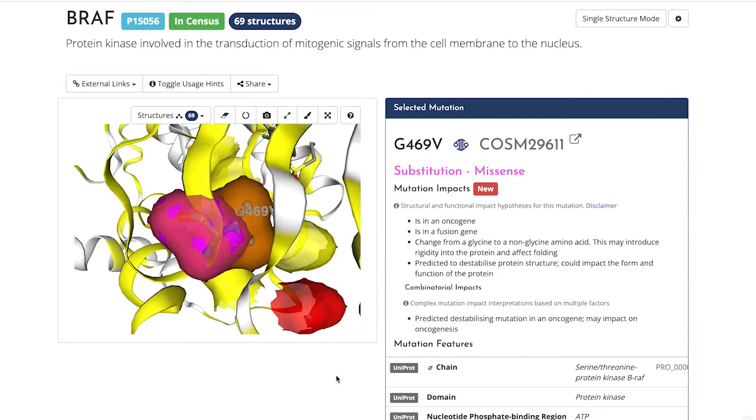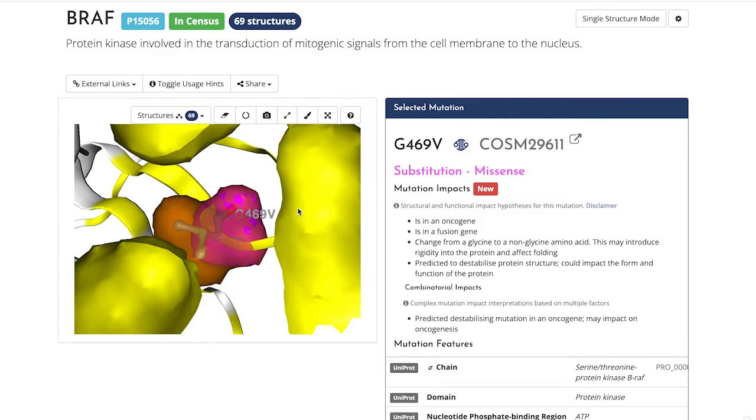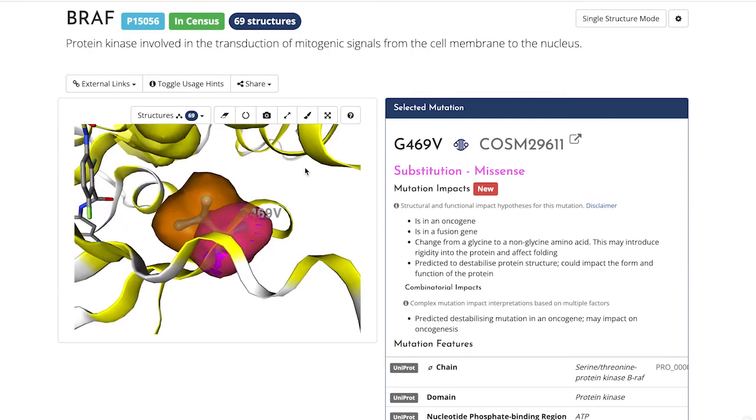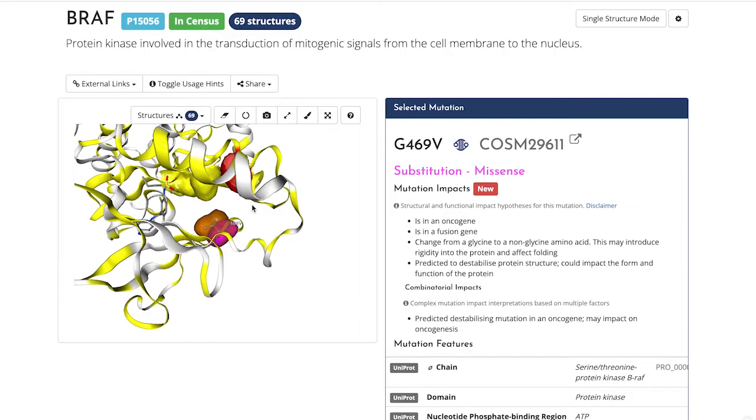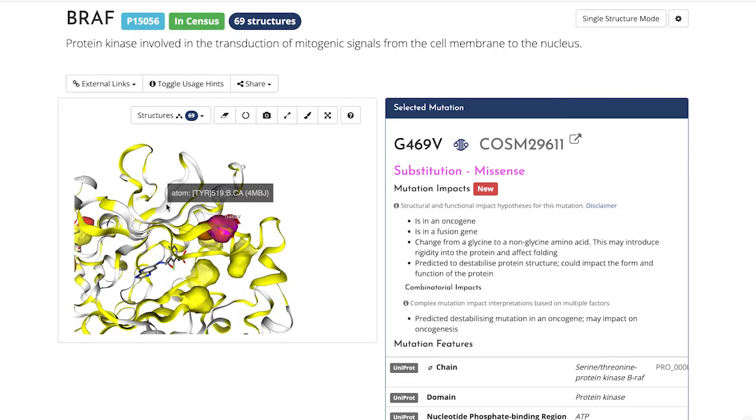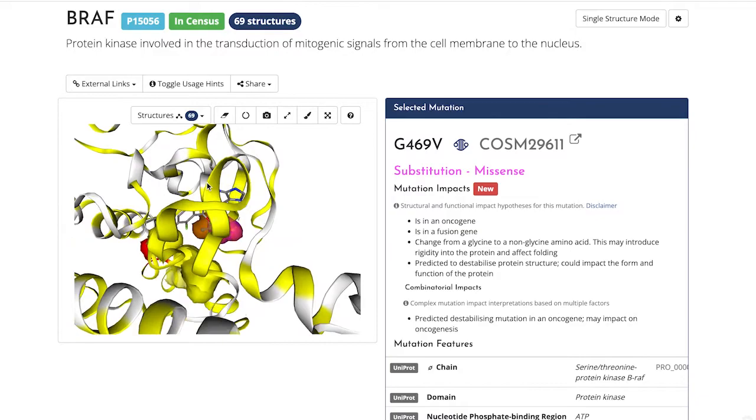And on to the exciting bit. You can actually see the predicted side chain of the new amino acid and the space it might occupy. Cosmic 3D substitutes the old amino acid with the new one. And in this instance, you can see the new chain comes into close proximity with the existing ligand in the pocket.